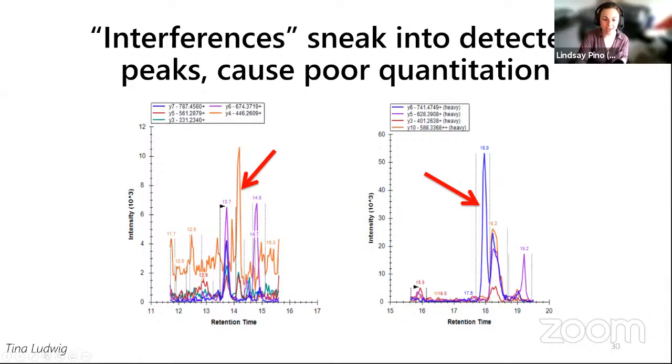So this is something that we'll be talking a lot more about later in the program as far as doing statistical analysis, but it always benefits you, even after you do a statistical analysis and you get the things that are statistically significant, to go back into the data using something like Skyline and convince yourself before you send the biologists off on a wild chase for a protein that's not actually differential. Convince yourself that the chromatograms are real.